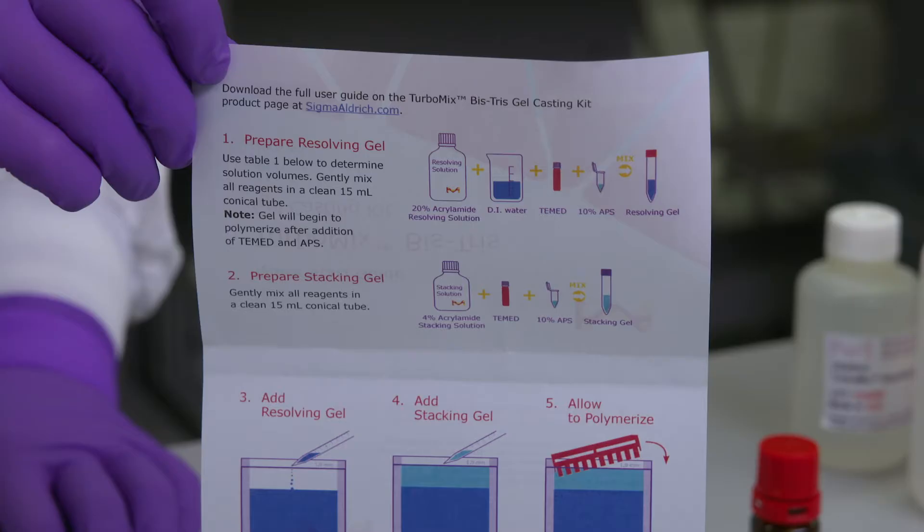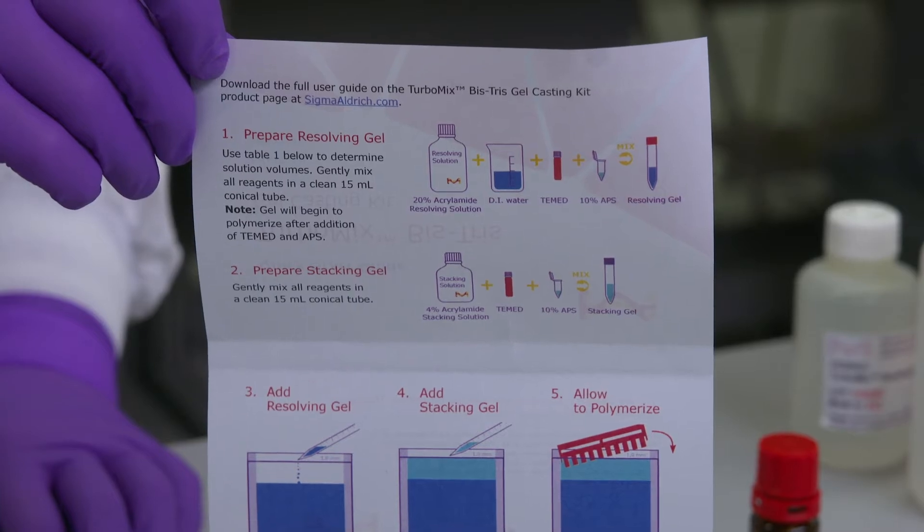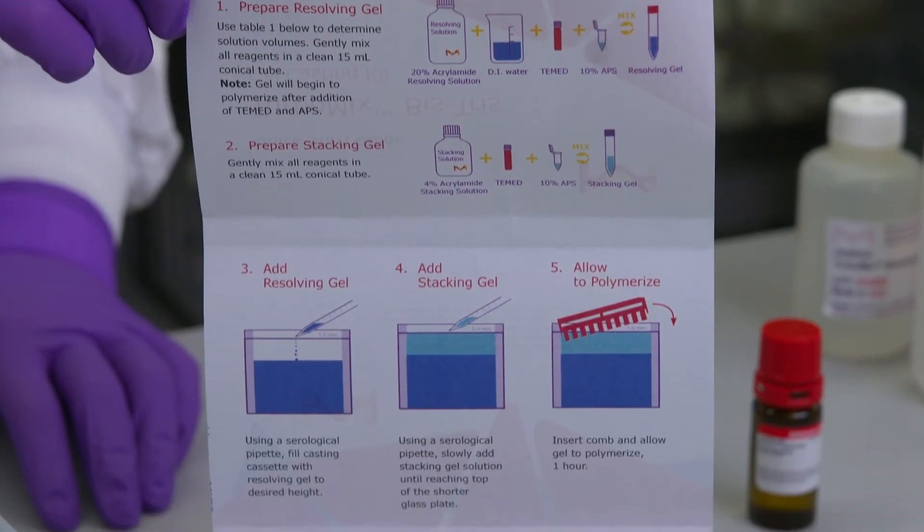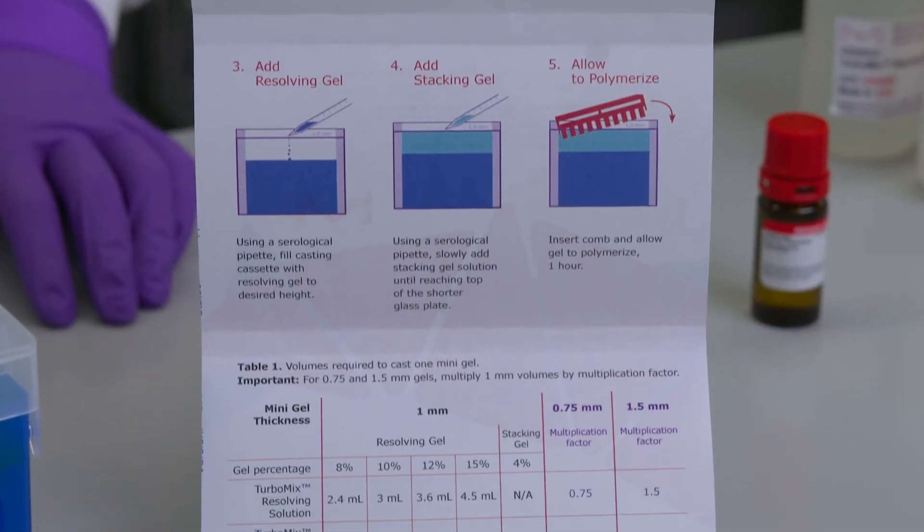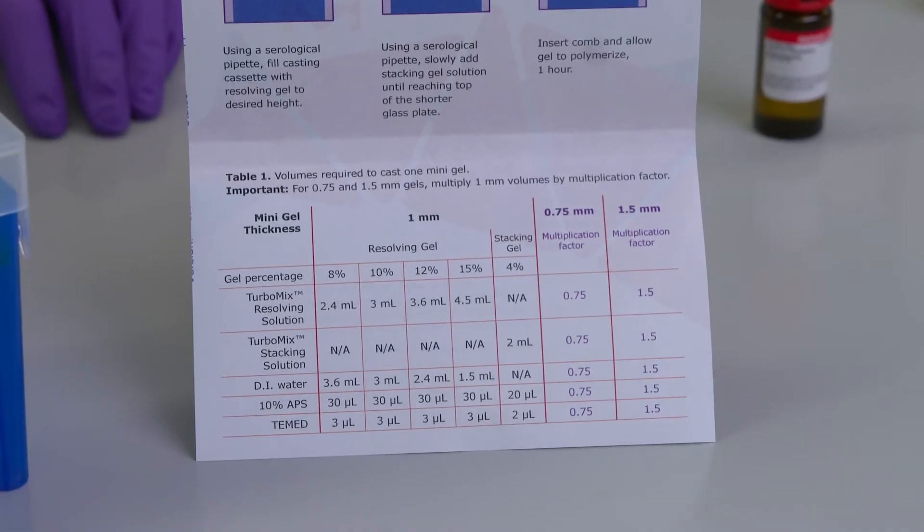Now I'll mix my resolving and stacking gels. You can use the tables in the user guide to calculate how much resolving and stacking solution you'll need. For this size cassette we'll need 6 milliliters of resolving solution and 2 milliliters of stacking solution.